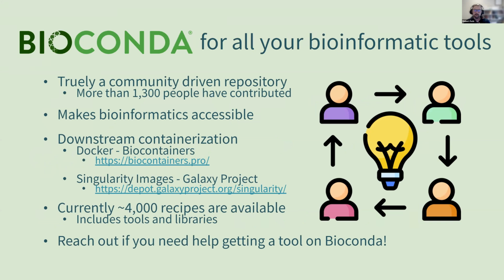The first is Bioconda. Bioconda is, I think, a very valuable resource for bioinformatics these days. It's truly community driven. The last I checked, more than 1,300 people had contributed in some shape or form to the Bioconda repository. It really makes bioinformatics accessible. No longer do you have to do the whole sudo make and sudo apt-get install. It's just conda install this and conda create this environment. And if something breaks, you just nuke it and start it back up.